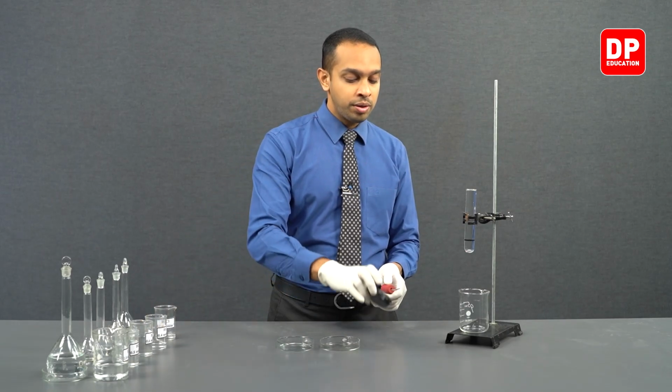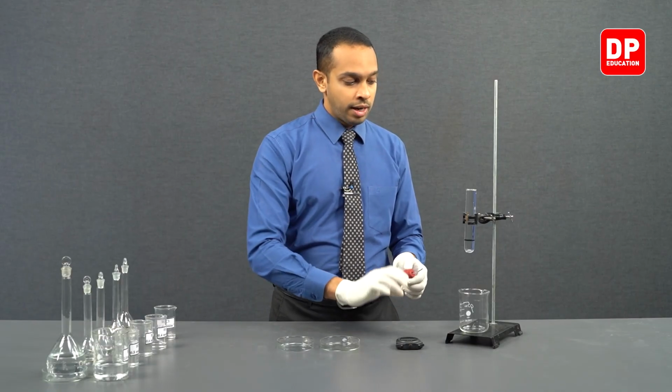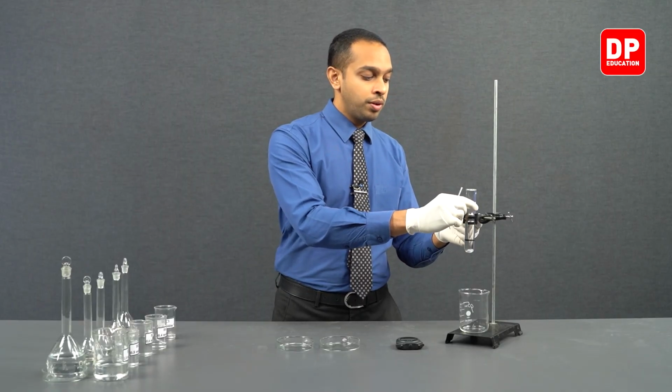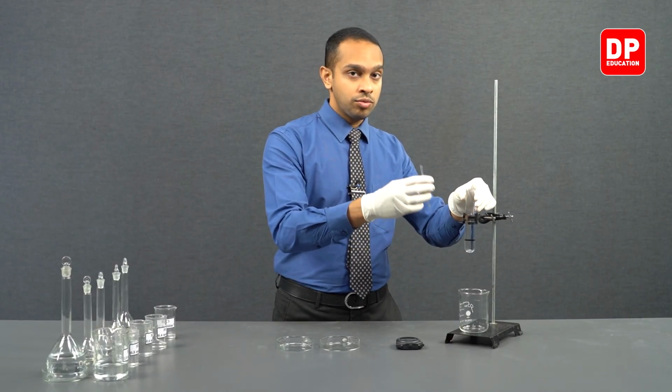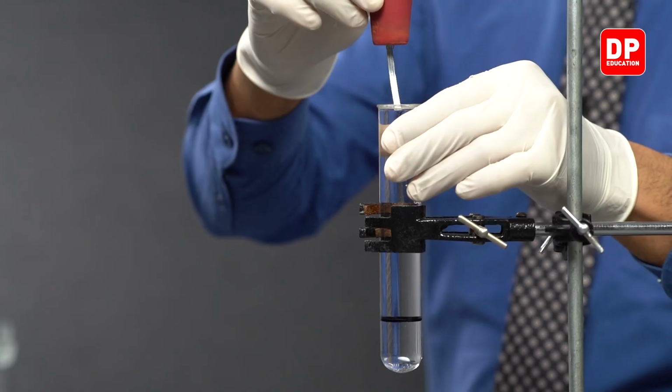Then we have to be ready with our stopwatch. As soon as we introduce this magnesium strip, we will be turning this setup upside down, and we'll be starting the stopwatch as well. So let's do that now.